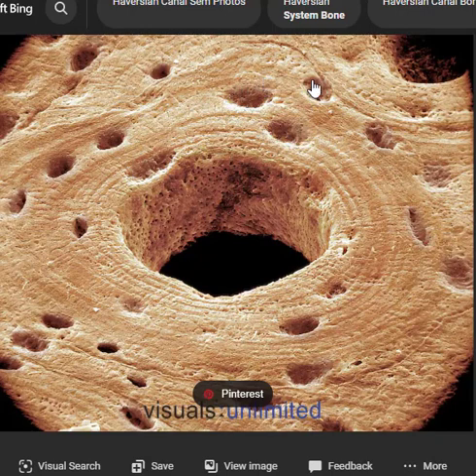But you can see the lacuna quite easily in this particular picture. And what's interesting about them is they lay down the bone in circles. So here it's almost like tree rings. If you look, there's the tree rings being laid down, and you come on out, and you see more of the tree rings. So this inner part right here is called the Haversian canal. There's the lacuna, and you can't see the cells in this particular one. When they sliced it, somehow or another they lost the cells.